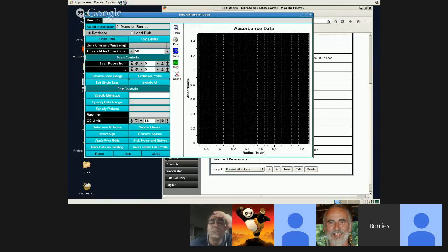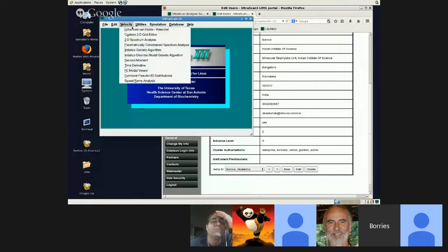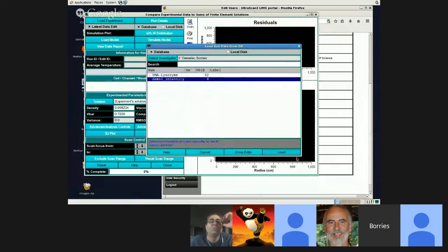The same error occurs when users in India are trying to access data. So I'm not really sure what to do next here to make this work. It was clearly there before and accessible before, because I've already analyzed some of the data. I'm going to see if I can load it into another program.